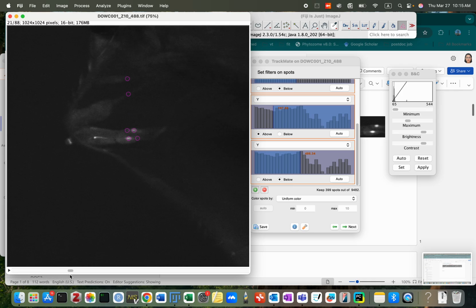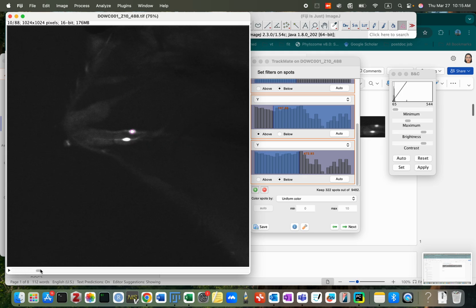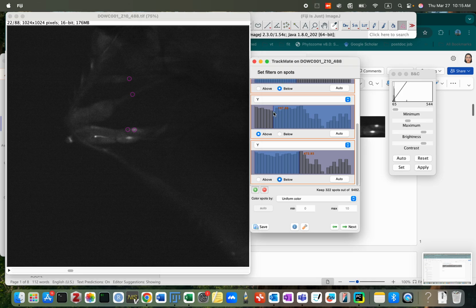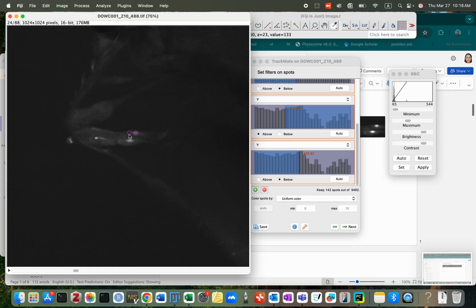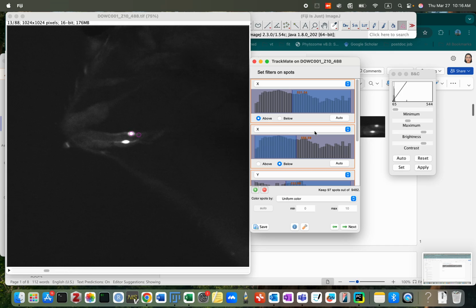Something I want to check is the weakest part. We have something quite weak. Let's see if I can manually adjust it better. At this point, we need to adjust the Y axis above to move it down. I'm not sure about this one, so let's work on X. Let's see the other direction. Good.